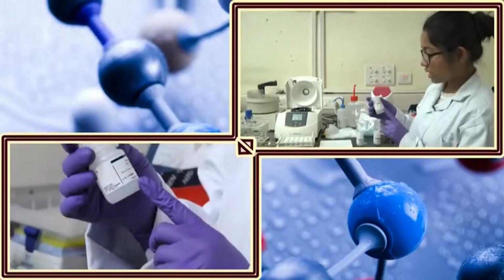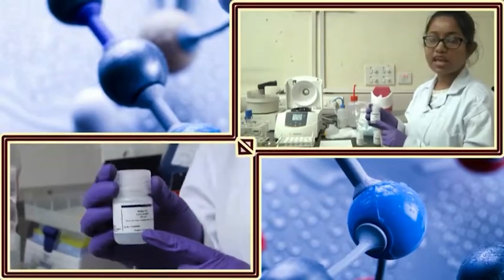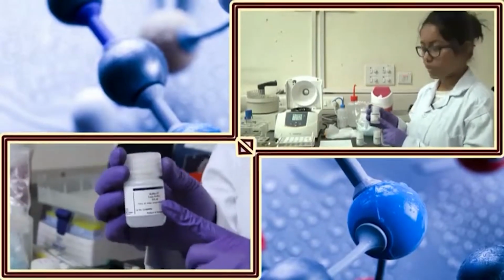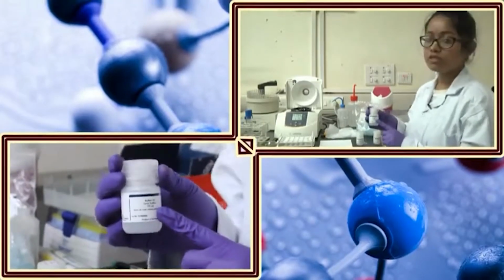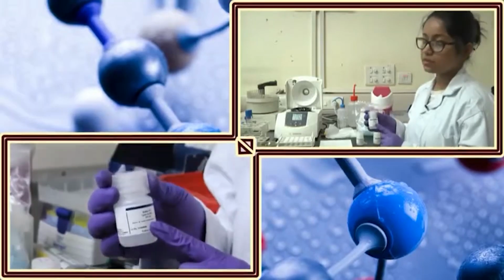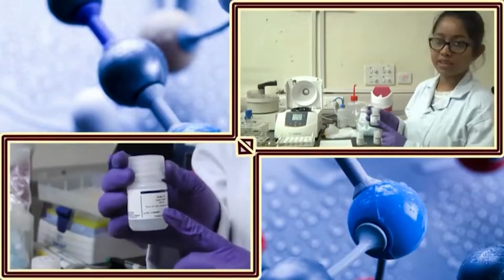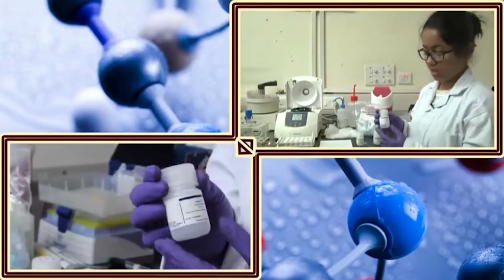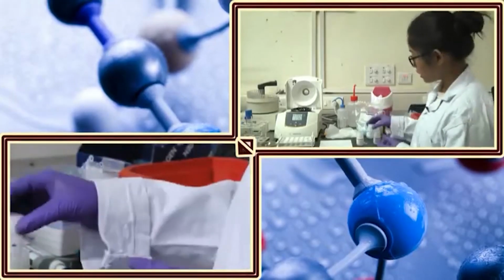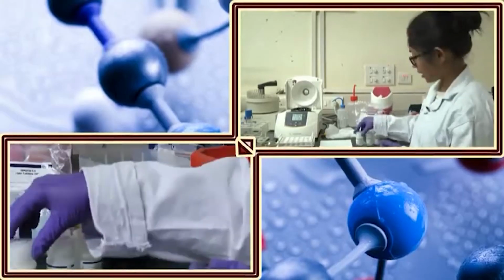So, this lysis buffer contains a high amount of sodium hydroxide, so it is an alkaline solution. It will also denature the DNA or RNA, whatever is present inside the cell. So, everything will be denatured when we give the lysis buffer. Now, after giving the lysis buffer, the timing is important. In the kit it is written that around 4 to 5 minutes is enough, and more than 5 minutes should be avoided, because the denaturing process is very time sensitive. So, do not keep the sample in the denaturing buffer or the lysis buffer for more than 5 minutes.